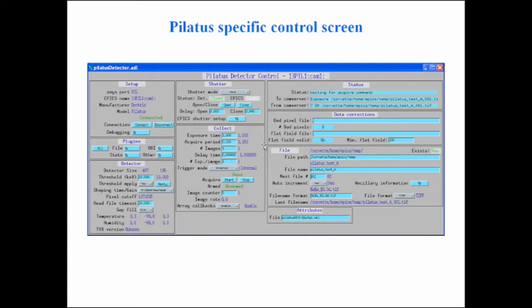There are detector-specific screens as well. This is the one for controlling the Pilatus detector — it has things like energy threshold (the discriminator level), temperature and humidity readouts, and other device-specific parameters. Things like acquire period and exposure time are base-class generic parameters; but there's also a delay time parameter specific to the Pilatus.